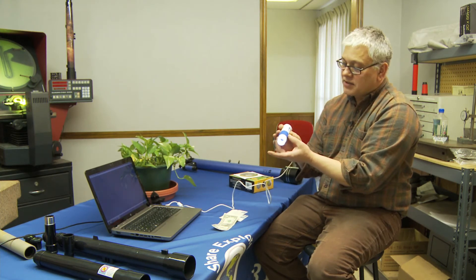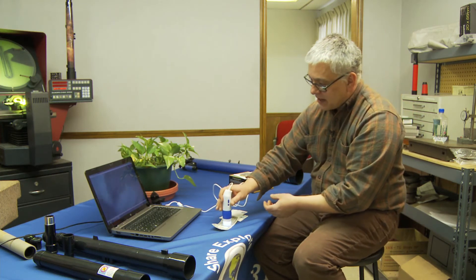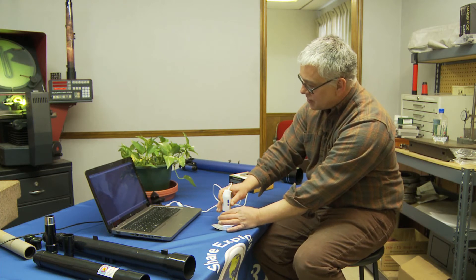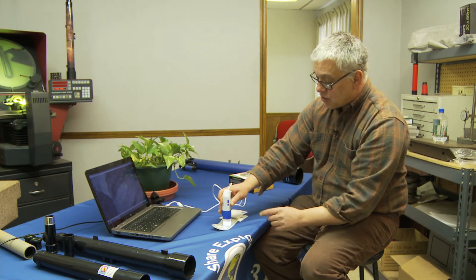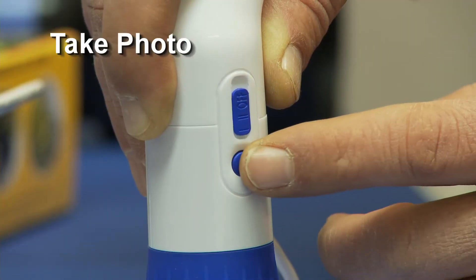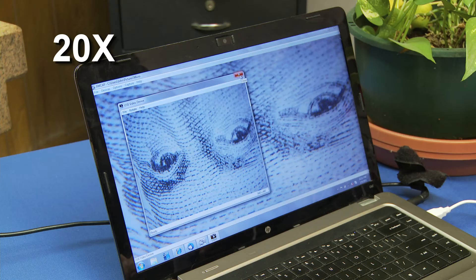So what I'm doing to focus this is I'm just turning this ring here. So if I drop it back onto the dollar bill and turn it, I can focus it at 20 times. Also, what I can do is there's a button here — boom — I just took a picture of what I was looking at.